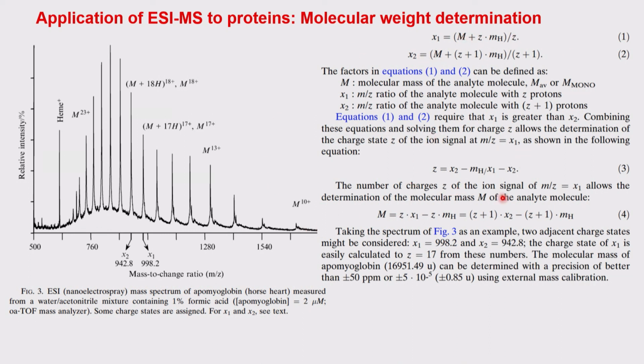If you introduce these, you can get the molecular mass.